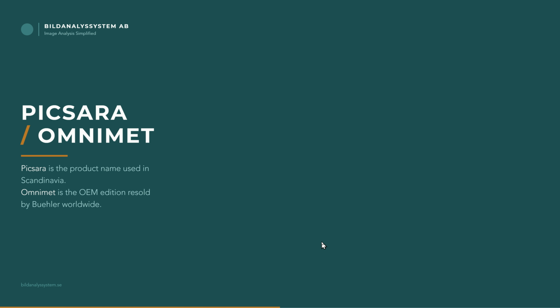So the product is a modular-based image analysis software. And the first level or bundle is called Capture and Measure. It's a basic entry-level software for just capturing images and storing and doing some easier control measurements. The advanced module is aimed towards entry-level image analysis.